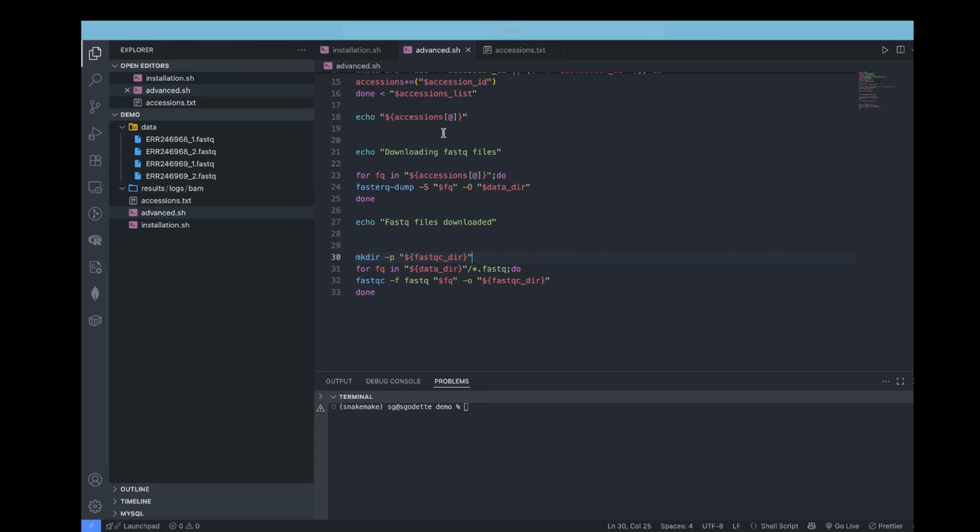One more thing we need to note is that we no longer need to run the fasterq-dump. If we leave this code as it is without hashing it out, then the program will start downloading the files again. So before running the program, I will hash this out by pressing command / and then request the program to let me know that the FastQC program is running.